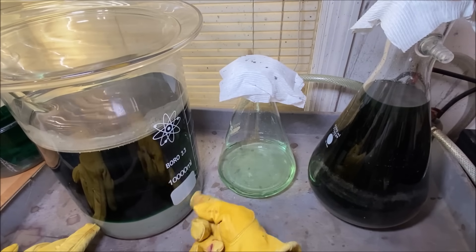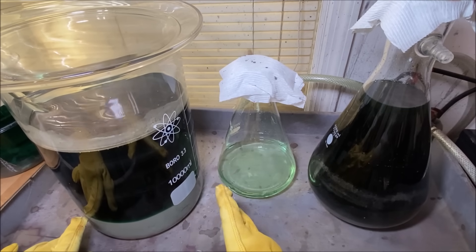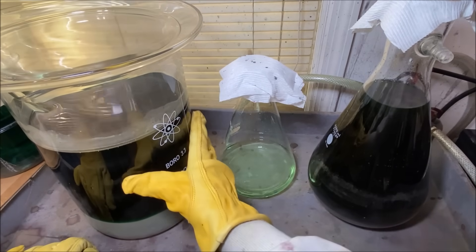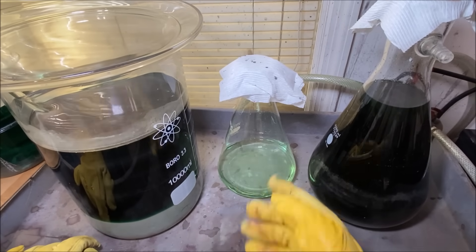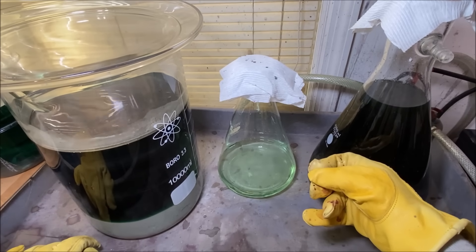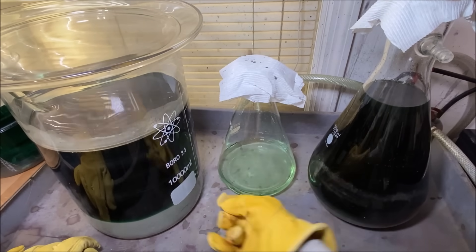The reason I did it in this beaker was so we could see the result and see how the silver comes out of the solution when we add the copper. I'm not going to use this beaker anymore because metal and glass is not a good combination. So what I'll probably end up doing is adding this, once it's filtered, to a five-gallon bucket, and then we'll add some clean copper to it and cement the silver out.